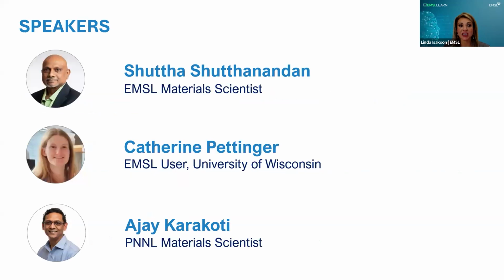So for today, our speakers include EMSL material scientist Shuttha Shutthanandan, who will provide an overview of X-ray photoelectron spectroscopy, a widely used surface analysis technique. And he will also explain how EMSL's new XPS high-throughput soil analyzer can accelerate your elemental soil interrogations.